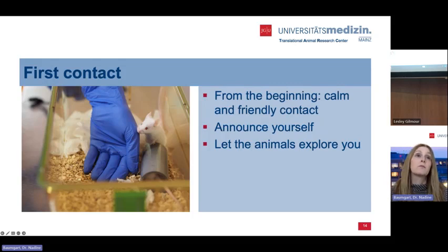And for mice, it might be even an option to consider a breeder, because there are some breeders which say that they do some gentling programs and the animals are very nicely used to handling, and so you have very friendly animals when you open the box.